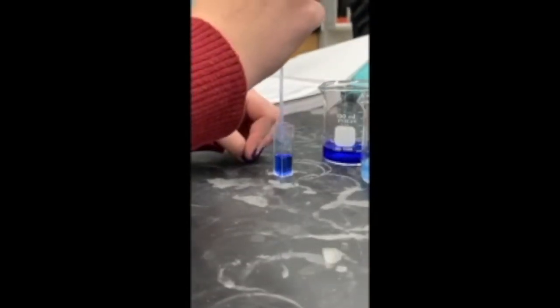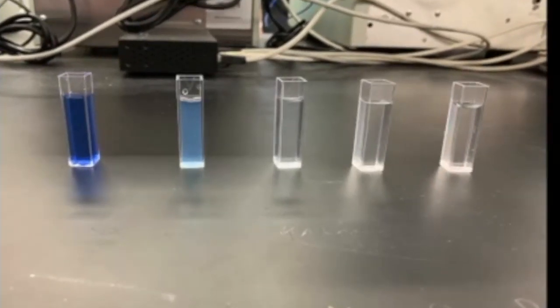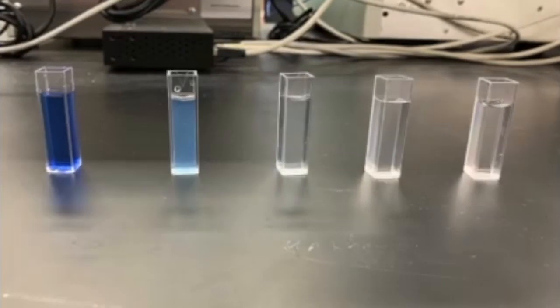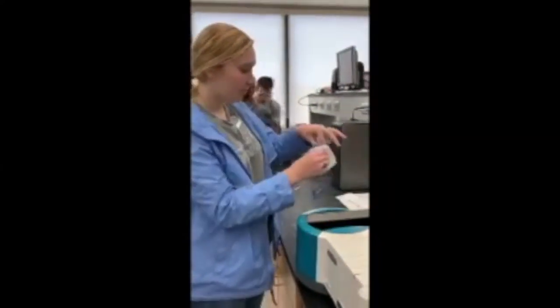After you've made your dilutions, you must transfer each one to a separate cuvette, being careful not to over or underfill it. You also will need to put your stock solution in a cuvette, as well as one with just water. When you're done transferring samples, you should have 5 cuvettes, 3 separate dilutions, a stock solution, and one with just water. Next, you must zero out the spectrophotometer before placing any cuvettes in the machine.